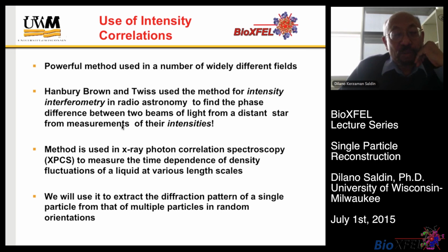So what we're going to do is to use the idea of intensity correlations in order to recover information about these randomly oriented particles.